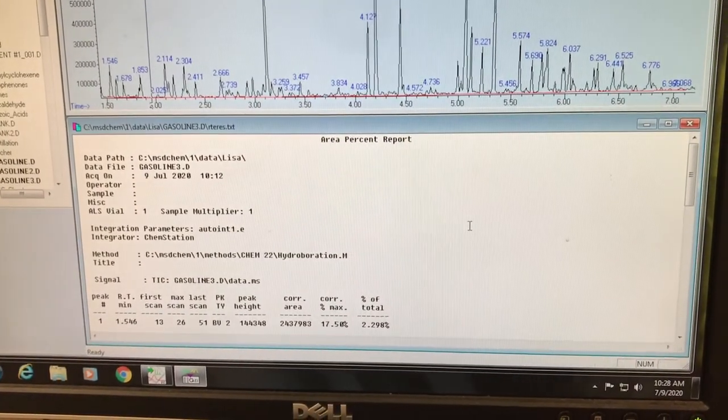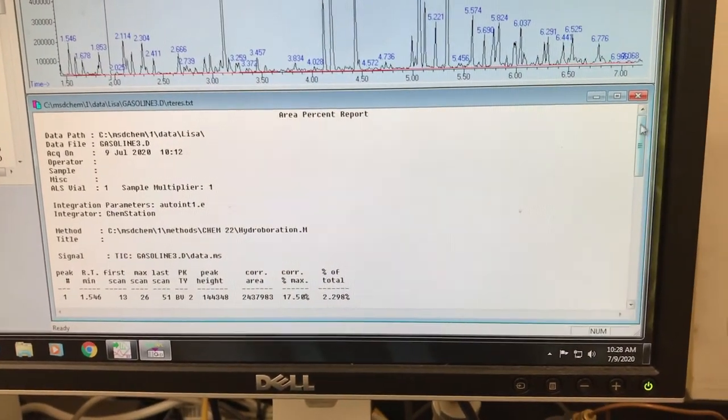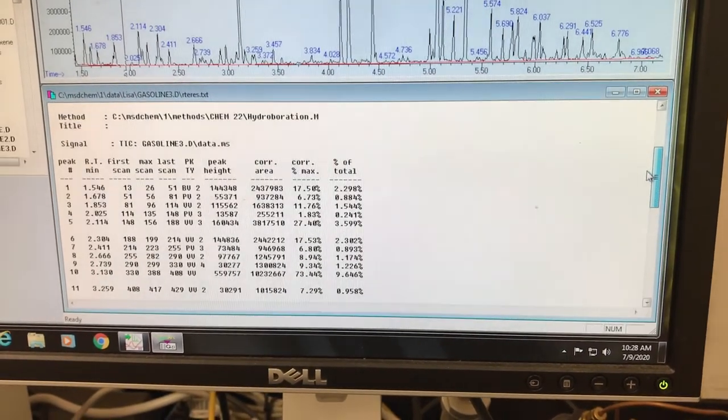Lastly you can choose the percent report and be able to see how much of each compound is there.